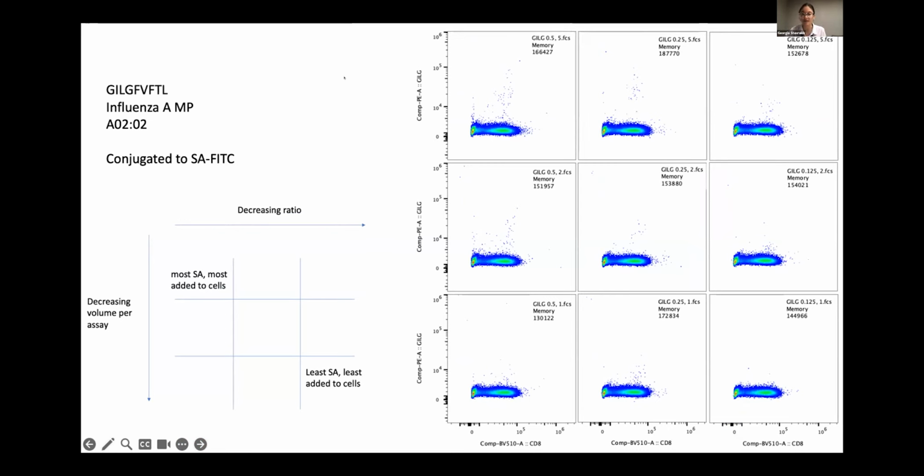And here as well, PE seemed to have a bit of a different titration, but still we were able to pick one that we felt reduced background, but still pulled out our antigen-specific cells. The next thing that we wanted to make sure was that these titrations that we were choosing weren't epitope specific, because obviously in the Hep C cohort, where we want to use these methods, there's a lot of different epitopes recognized, and this would be very inefficient if we had to change the titration of fluorophore depending on the epitope that was loaded onto the pentamer.